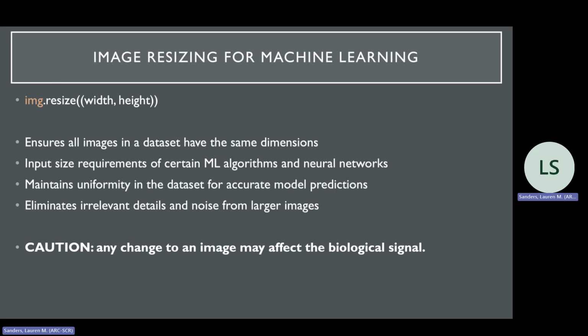So before blindly going ahead and resizing your entire dataset to the same size for a machine learning workflow, make sure you understand your dataset and what that change is doing to the data and to any biological signal that you're hoping the model will pick up on.